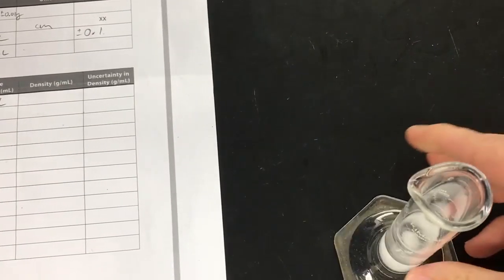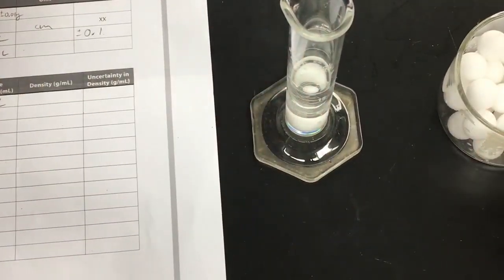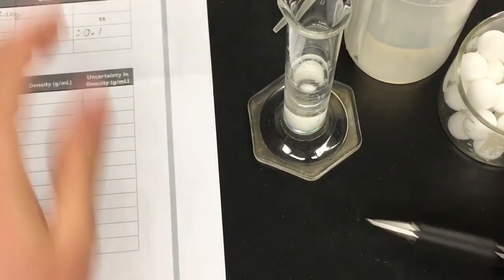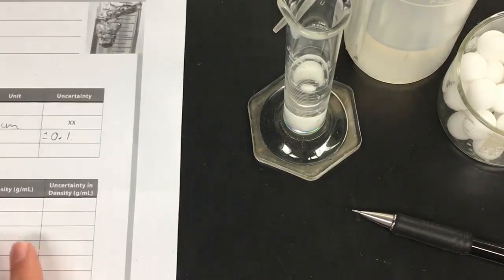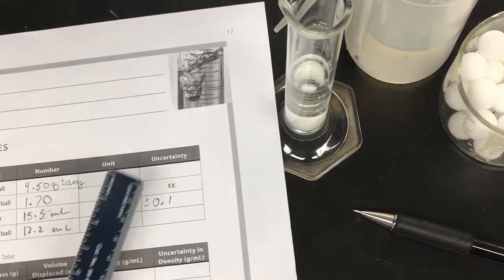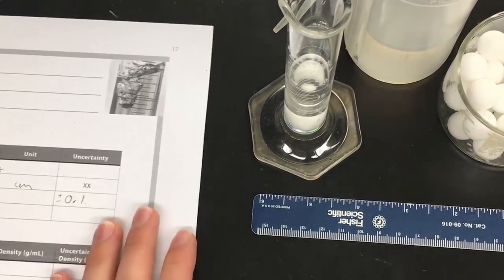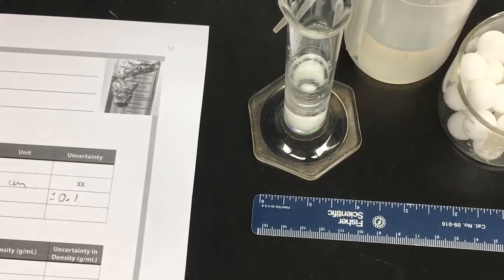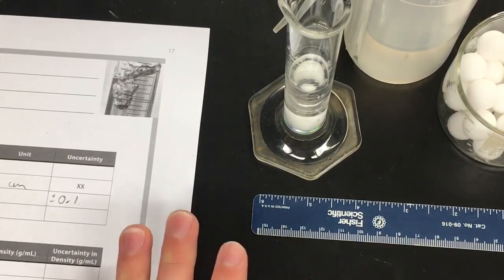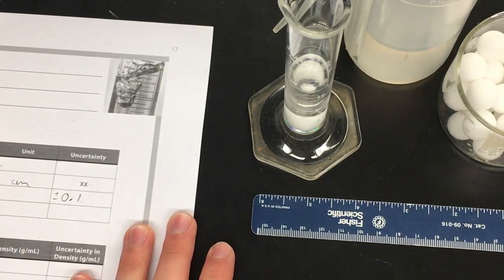I believe what we're going to be doing is sending you a sheet of data from another lab. This was really just to show you how you would be doing this if you were in lab, and hopefully teaching you how this technique works, because eventually all this is going to be over and we're going to be doing labs and classes in person. We just want to make sure that you're up to speed enough so when you're doing a molecular bio lab, you have the skills and knowledge and tools to do some cool experiments.